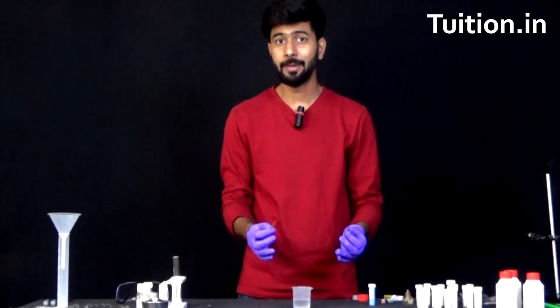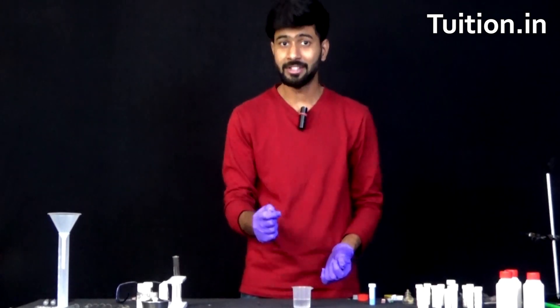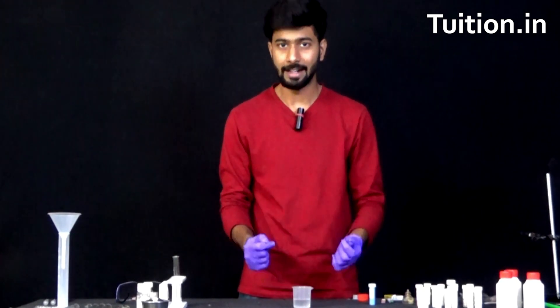Well, this particular experiment is going to really help you understand whether it's iron or whether it's copper which wins the battle when it comes to chemical reactivity.